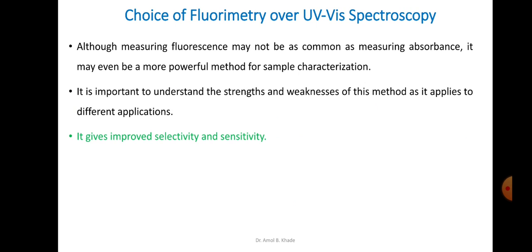So these are the applications of fluorescence spectroscopy with the pharmaceuticals and other fields, right, and even as I mentioned, we can extend it even to non-fluorescent substances, especially by using chemical derivatization.